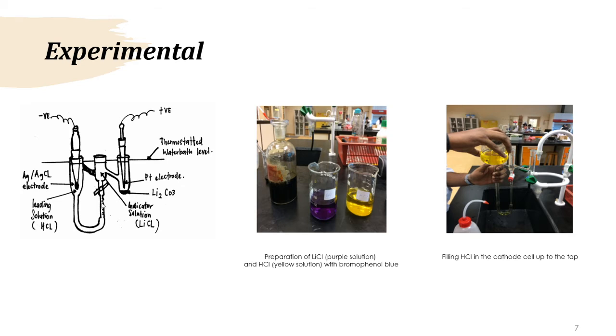Because it's made using broken parts, used parts of used glasses, from one cell to the other the graduated lines may not be the same in terms of volume.